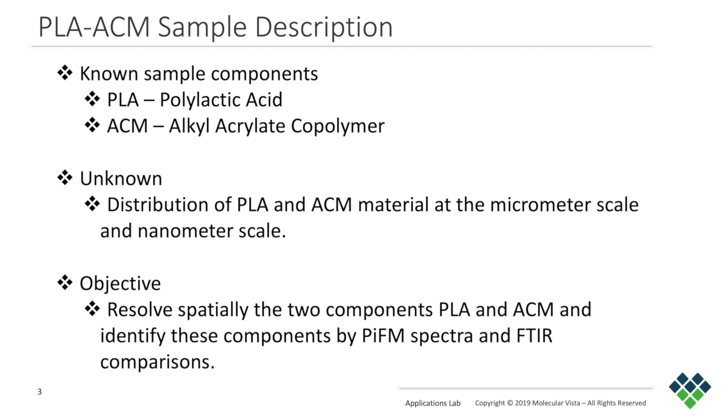So our objective in our short imaging session we'll do together is to resolve spatially the two components of the PLA and the ACM and identify them by PiFM spectra, and we can do some FTIR comparisons from literature.